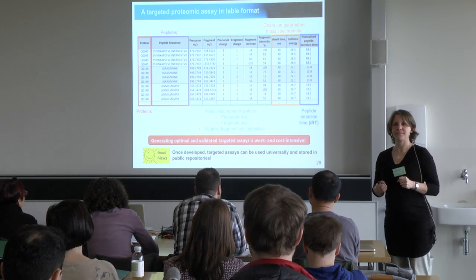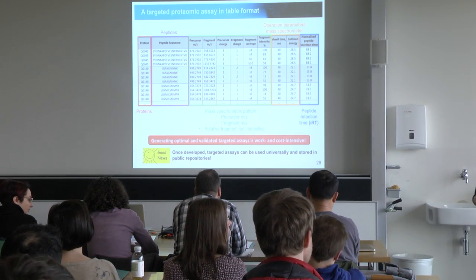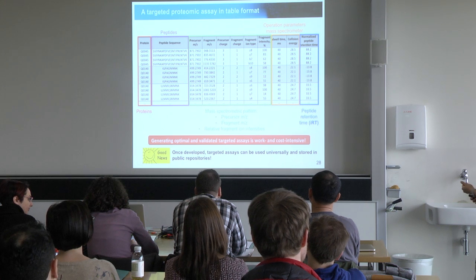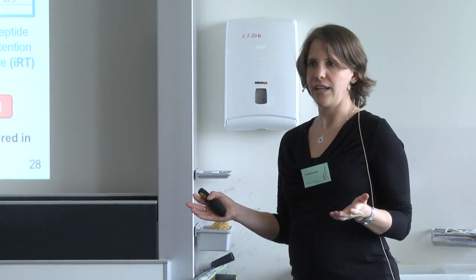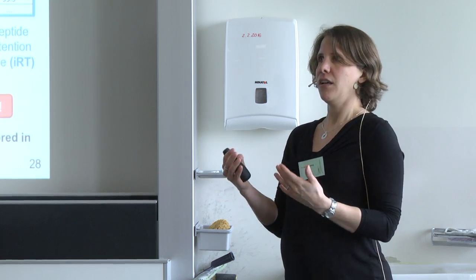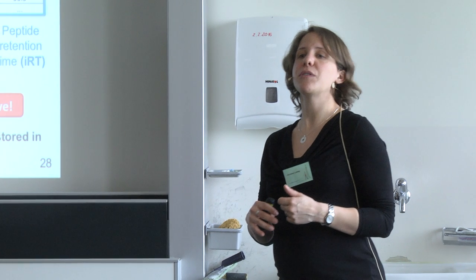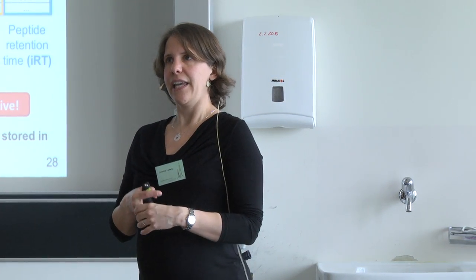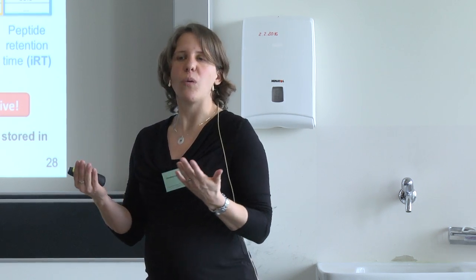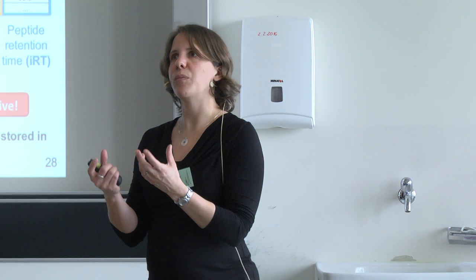Yeah? So do you also use multiple charge states when you look at them? Yeah, so usually if there is a dominant charge state, I go for the dominant charge state. So dominant means like if 2 plus is 60 or 70% and the 3 plus is only 20% or 30%, I only go for the higher abundant charge state. If I have 2 charge states that are really 1-to-1, you can also use both. Or you can even make a combination of charge states.